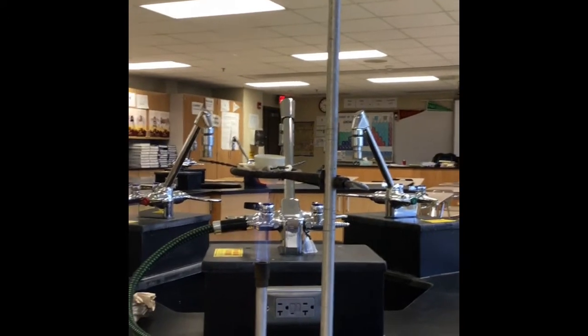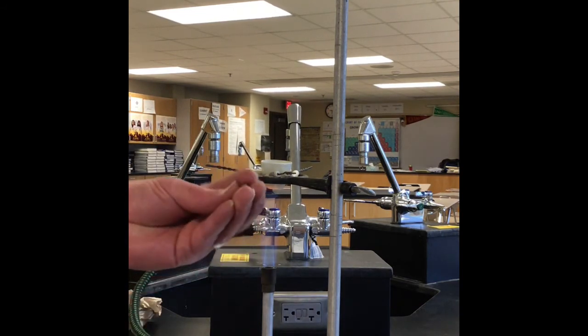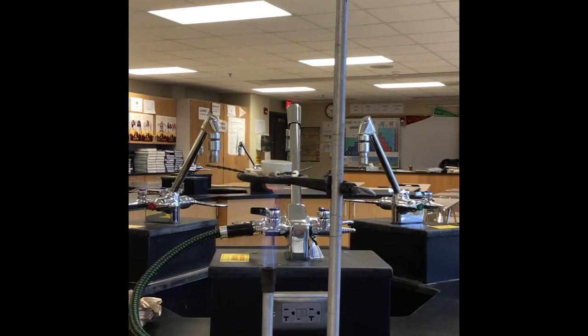We have a Bunsen burner going and a crucible that's heating up a little bit. And now we have our magnesium. I rolled it up a little bit, so it's kind of in a little ball here. So now I can just drop it in there, and we'll see what happens.